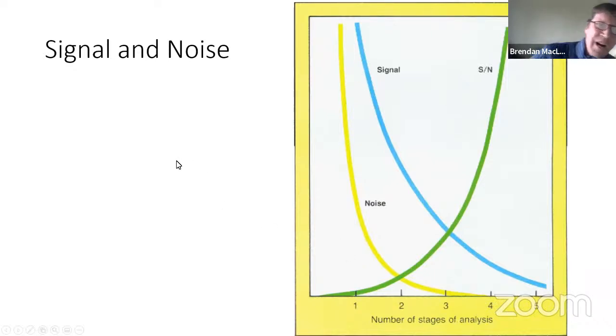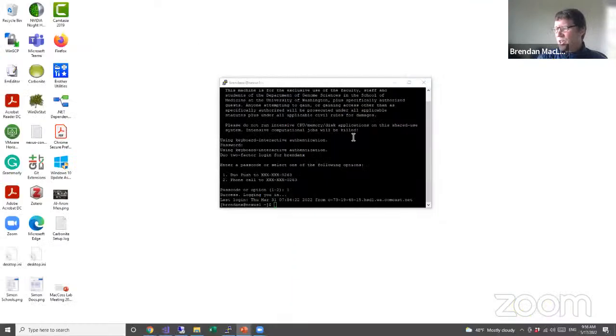So, when we've had these discussions about whether we should use sample specific libraries or big wide libraries and what are the priors, frequently, I think everybody can agree that if all I do is add noise, so if all I'm doing is adding peptides that are not changing, I'm actually making my life worse. So the more I can know up front and the more I can increase my signal and reduce my noise, the better. And sometimes when I just go with bigger and bigger data sets, I'm really just adding a lot of noise. And with that, I will turn things over to Mina to dive into the details of those data sets we just talked about.